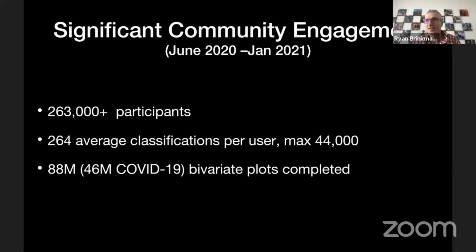So we're looking at data sets that are related to COVID. For example, people in nursing homes who had been affected by flu, because we thought that might be interesting comparisons at the end to start people going. And then it helps us sort of benchmark. We also wanted to benchmark data. So we're using data where we've had a lot of experience in my lab.